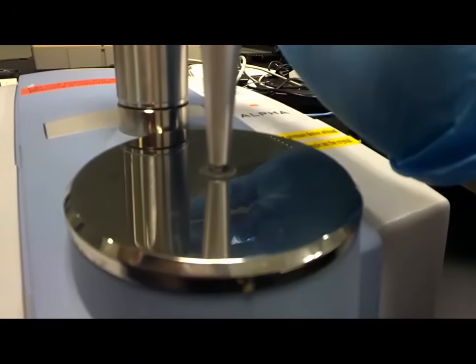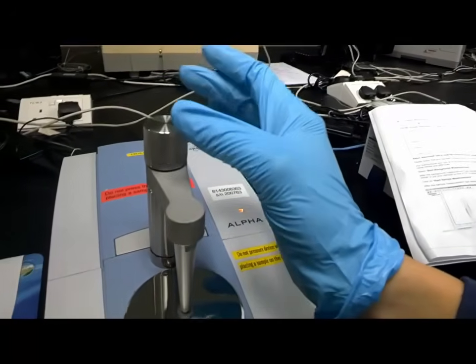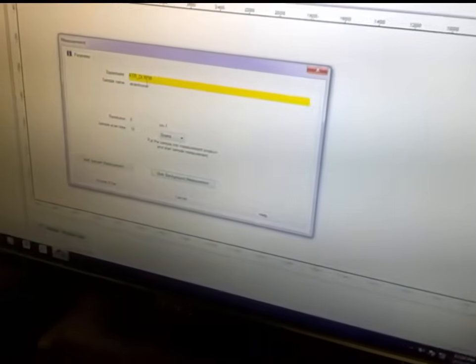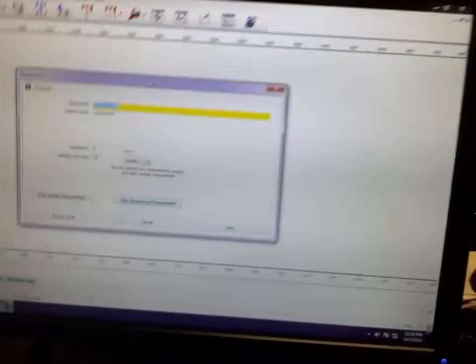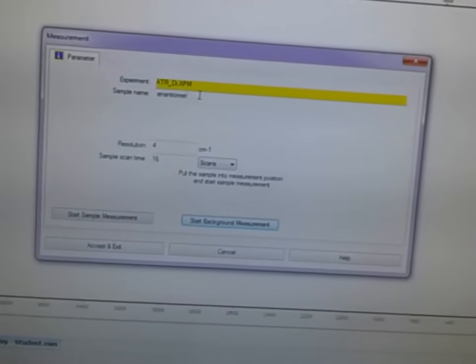Alright, so now it's secure. Not too hard — be gentle. Now it's all good. So now we label the experiment. This is sample 2C.